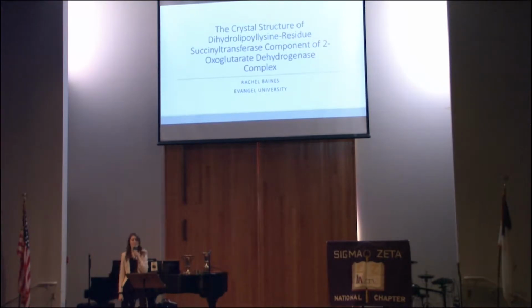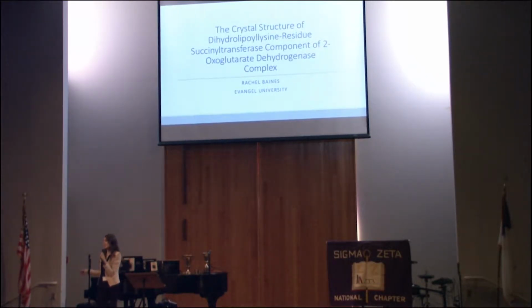And today I'm presenting on the crystal structure of dihydrolipoyllysine-residue succinyltransferase, component of 2-oxoglutarate dehydrogenase complex. That's a mouthful. So I have a story for you. We originally tried to crystallize this one protein, and then along the way ended up crystallizing another protein.